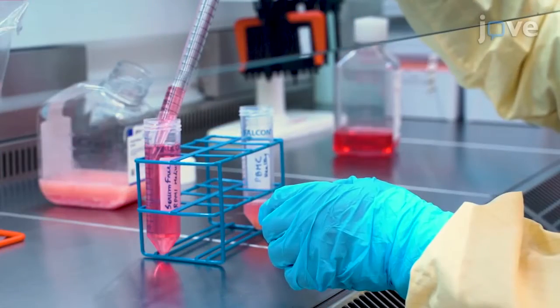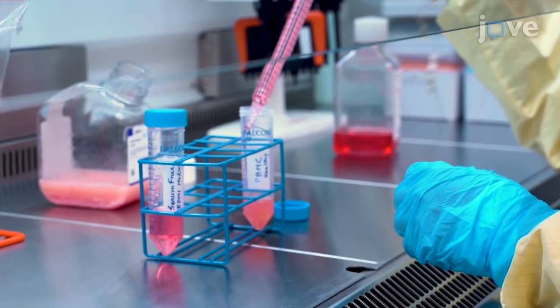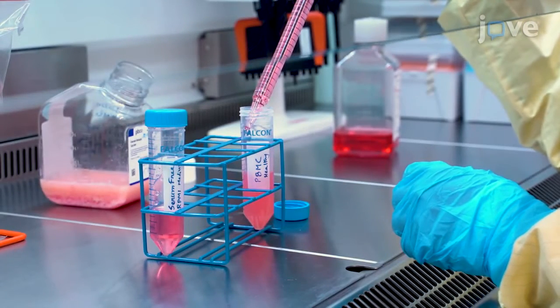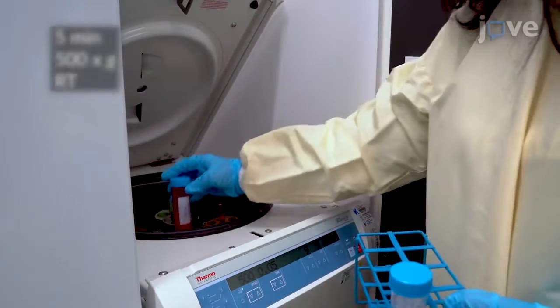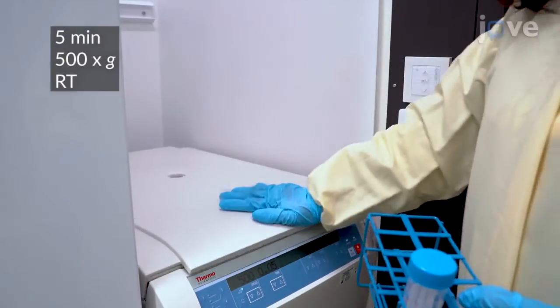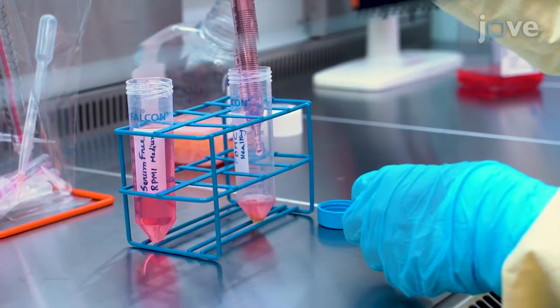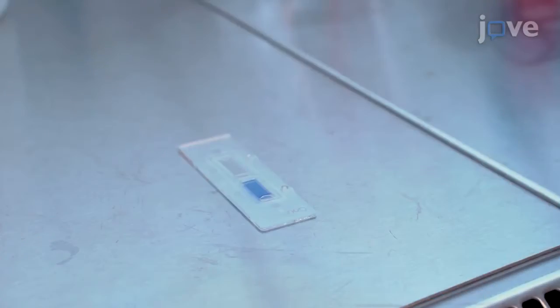Add serum-free RPMI medium to the cells to a final volume of 50 milliliters and gently invert the tube a few times before centrifuging. Then re-suspend the cells in 20 milliliters of serum-free medium for counting.